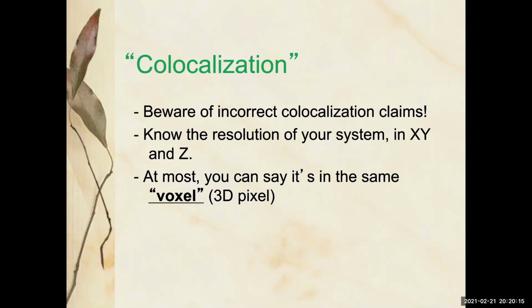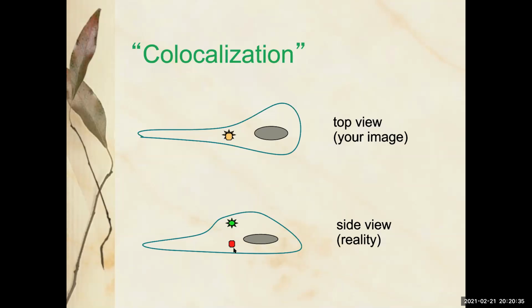A pixel is when you're thinking about the little square on your CCD camera chip that is capturing the light. That's 2 dimensions, but that light is coming off a little part of your specimen, the part of your specimen that is closest to you and also the part that's furthest away from you. And this is a profound thing, actually.